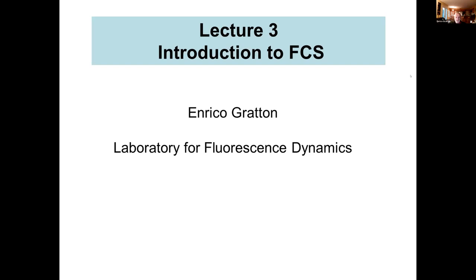So I will talk today about introduction to FCS. And I will say that I started to work in FCS before FCS was called FCS. And I was interested in protein dynamics. And the idea was to follow a movement of a protein while they happen in real time. And of course, in order to do that, you need to be able to work in single molecules. So everything I will say is referring to single molecule, which is not the common presentation of FCS.